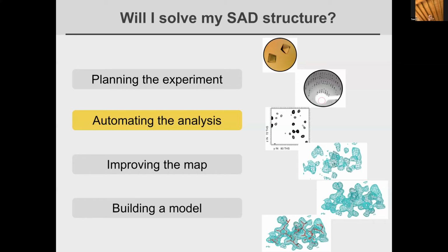And so in the experiment that we're talking about today, we're going to need very accurate data. And why do we need accurate data, just fundamentally? Our little tool told us we need accurate data. Why is it telling us that? It's because our signal, the anomalous differences that we're measuring, are a couple percent of the total scattering.